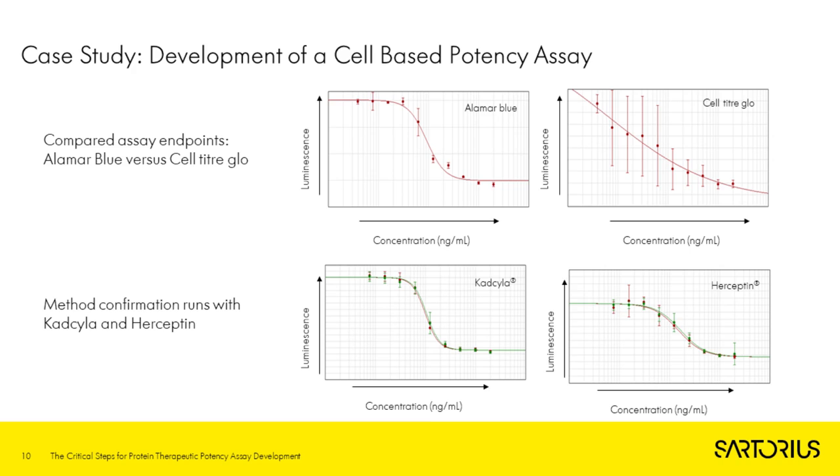We compared assay endpoints, two plate reader based examples, Alamar Blue and CellTiter-Glo, were shown here. And we also looked at non-plate reader based readouts such as real-time cell analysis. And once we've assessed the different factors, we confirmed the method with both Kadcyla and Herceptin to demonstrate the broad-based suitability of our platform methods.